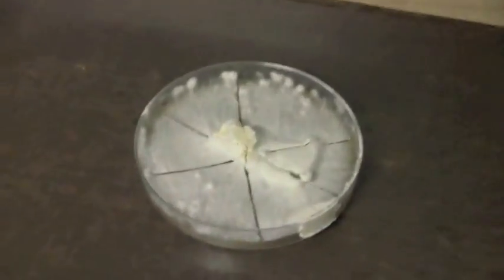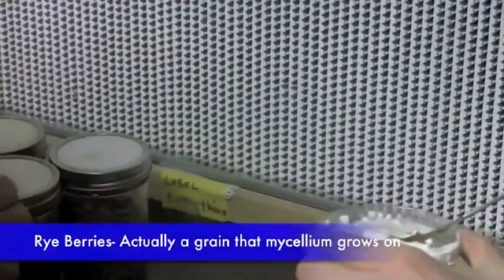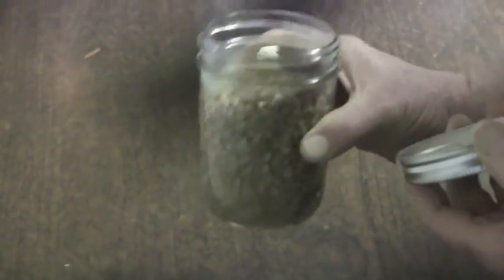Keegan's counting them out, making sure he's got 6. And this is the transfer. This is where we're working on our lab techniques, trying to not touch anything, quickly closing the lid to the rye berries, and we're dropping in the mycelial growth. Sometimes we have to shake it to get it in there to make contact with the grains.